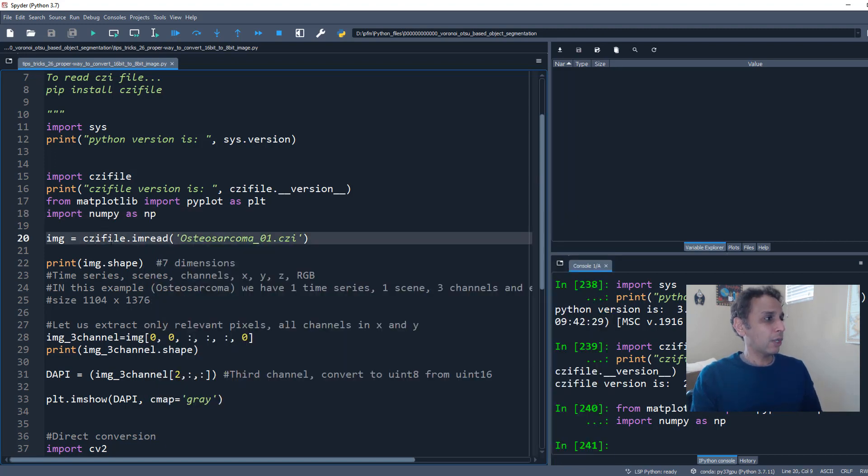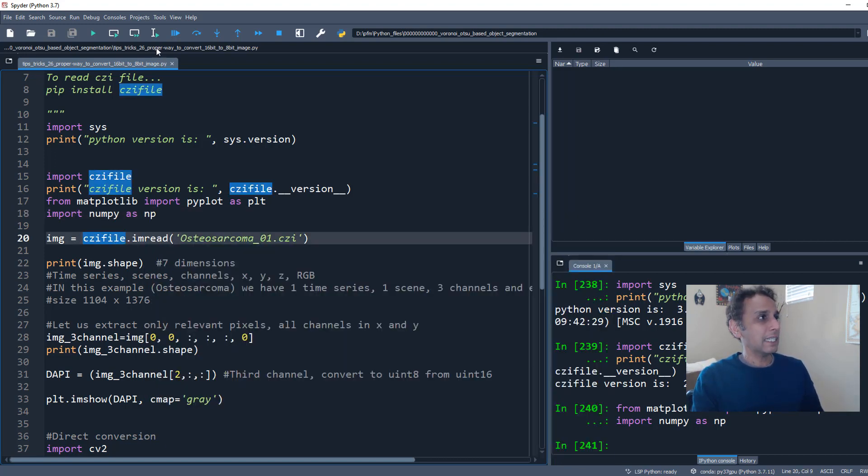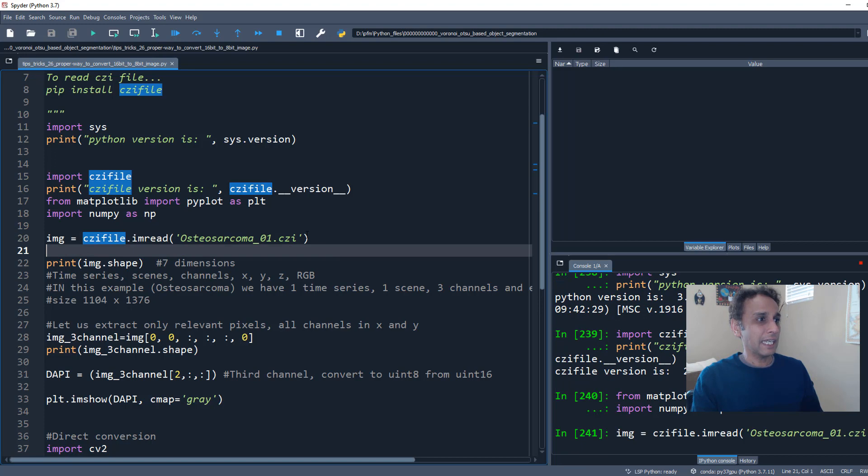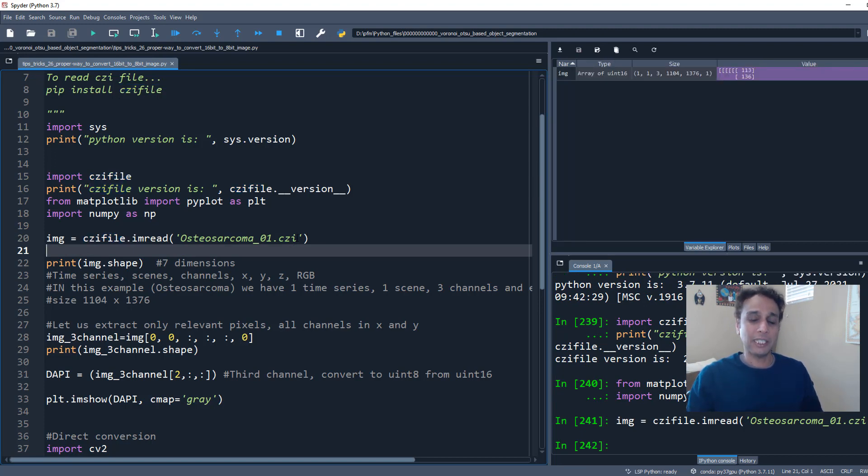And let's go ahead and read the image. And again, CZI file, the reason I love to work with the native format, the CZI file format in this case from Zeiss microscope, is because it captures all the information.